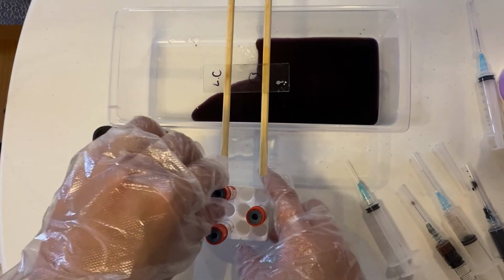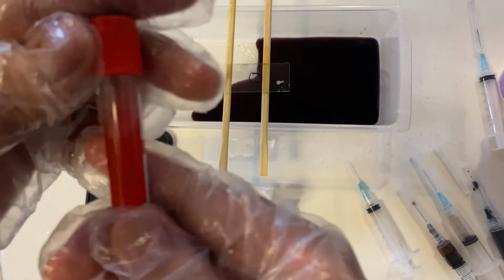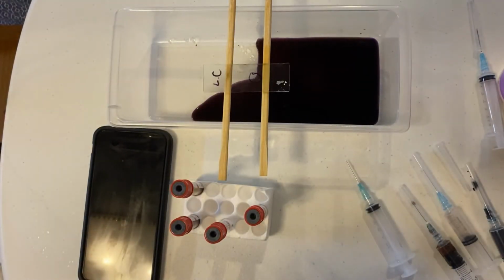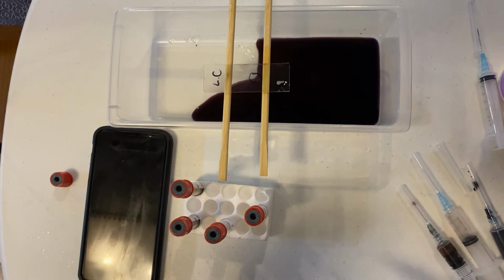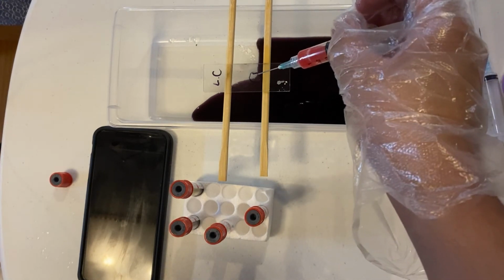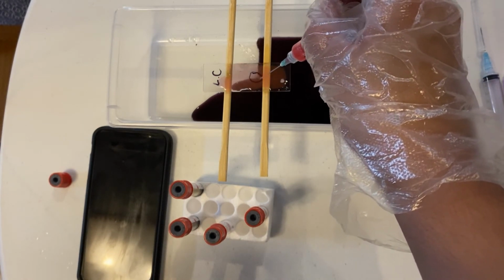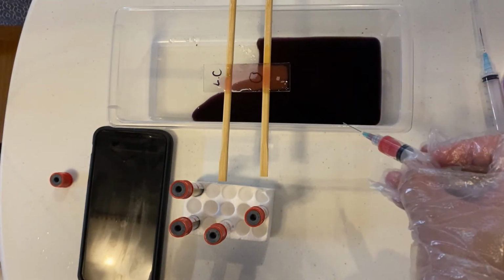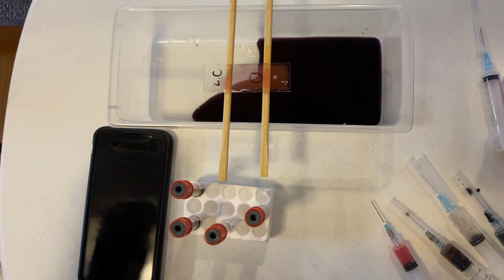Lastly, we will use a counter stain of safranin on the glass slide. This will last for 30 seconds.